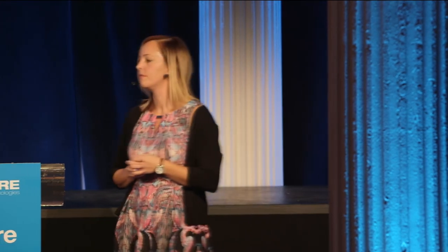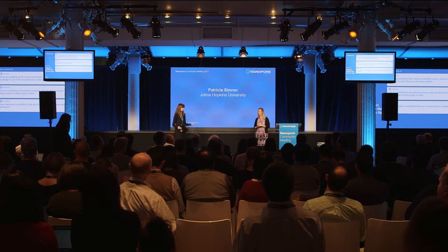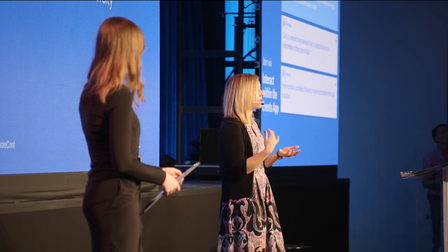Okay, fantastic. And just take one more maybe from the app. Have you established any QC criteria for your MinION runs, so minimal read depth, coverage, et cetera, for more routine assays? So we haven't gotten to that point yet. Right now we're still in the R&D phase. Right now we're sequencing one isolate on a flow cell, which we're getting 1,100 times coverage. And so we're trying to make that a little bit more cost affordable for clinical sequencing moving forward. And so at that point, I think once we get through the R&D step, we'll start to establish more QC parameters on what read coverage depth we want. But at this point, we haven't.